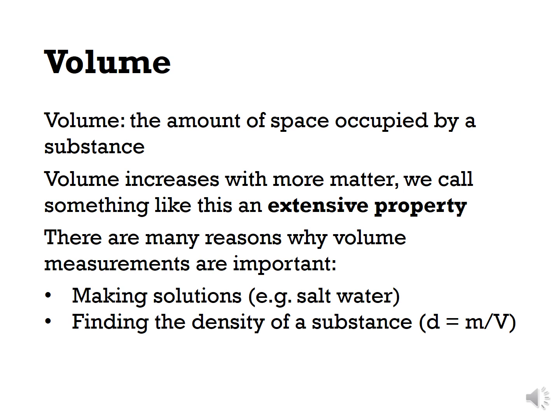First, let's talk about volume. Volume is the amount of space occupied by a substance. Volume increases with more matter, and we call something like this an extensive property. There are many reasons why volume measurements are important.